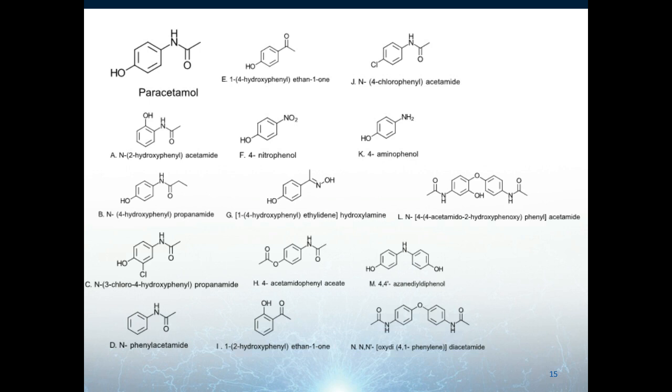Since the Halo C30 is a very long silane, we've decided to bond that on our larger pore size particle, the 160 angstrom pore size. So since it has a bigger pore size, it has less surface area, and that's the reason why there's less retention for the Halo C30 compared to Halo C18.